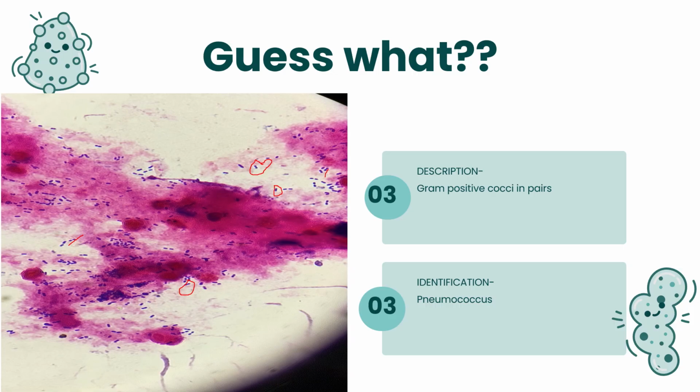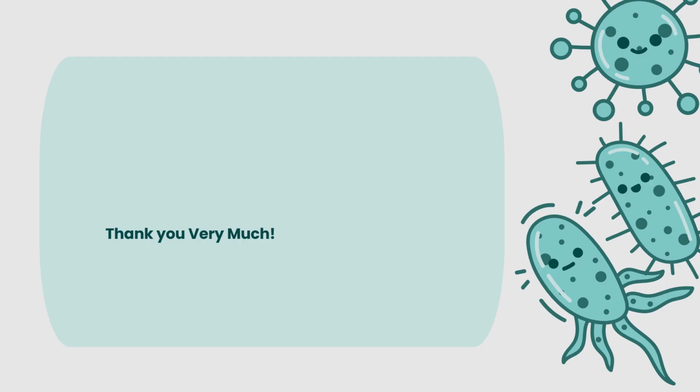Streptococcus pneumoniae or pneumococcus. Thank you very much for watching the video.